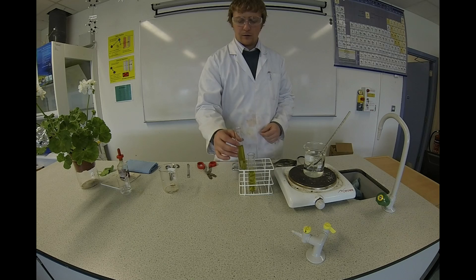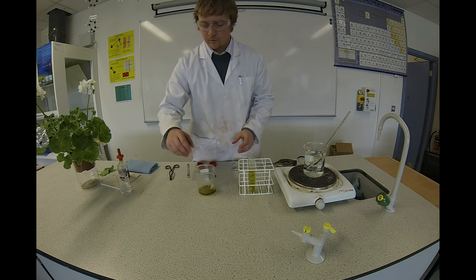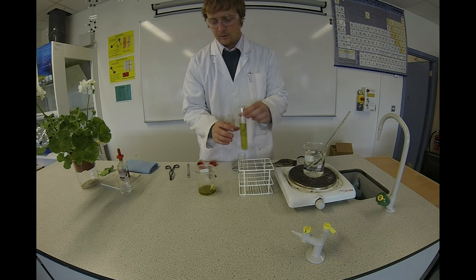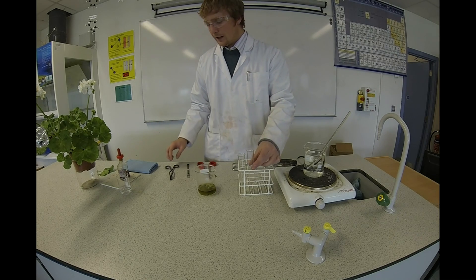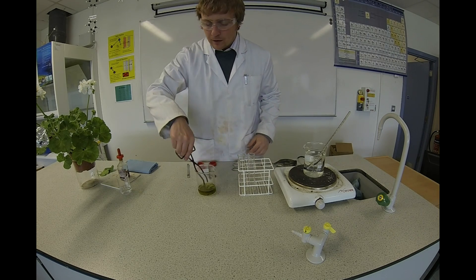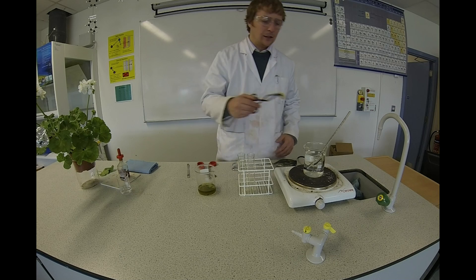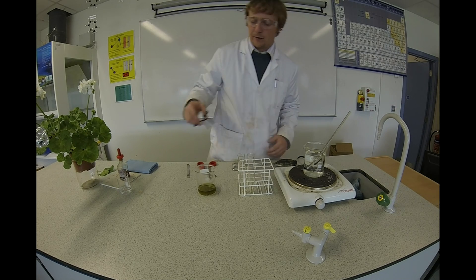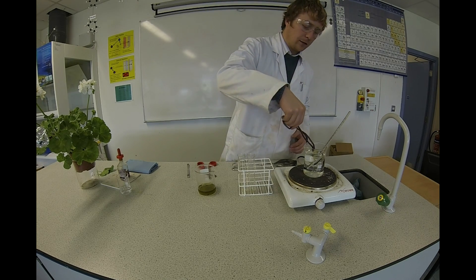I'm going to get my leaves and place them back in the hot water, because at the moment they're very brittle and this just softens them up a little bit. They only need to go in for a few seconds.